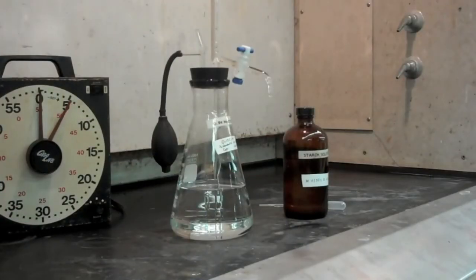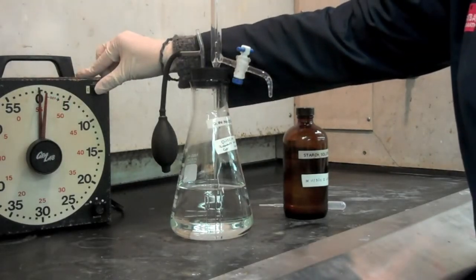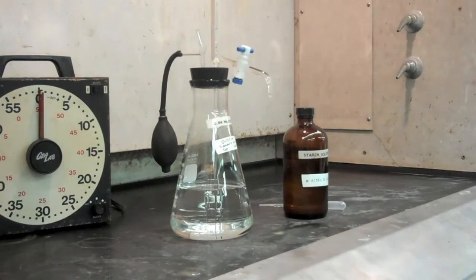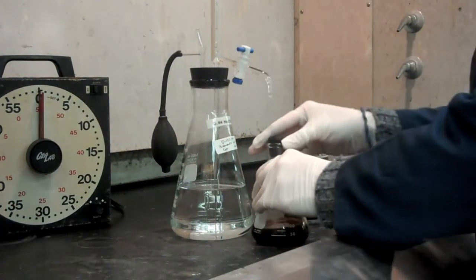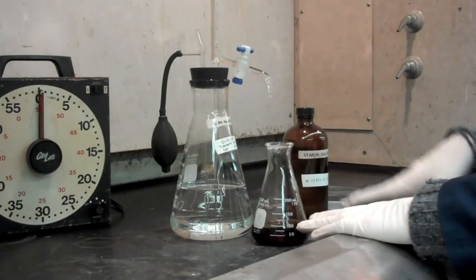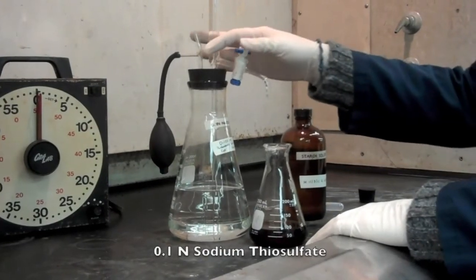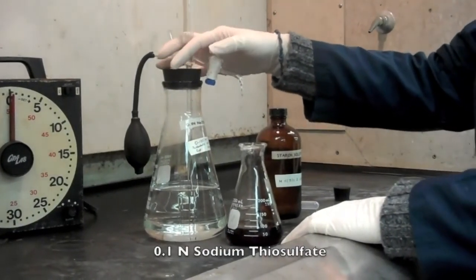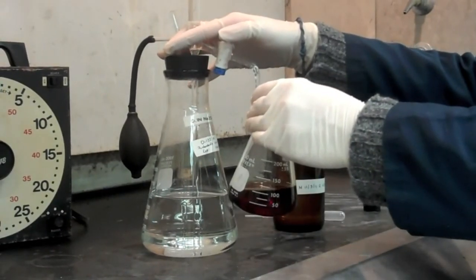Okay, now that our 30 minutes have gone by, we'll shut our timer off here. We'll grab our sample from the dark, and we are going to titrate now using a burette the leftover iodine, because remember we added an excess. We're going to use 0.1 normal sodium thiosulfate, and the first part of the titration is going to be a very light yellow colored endpoint.